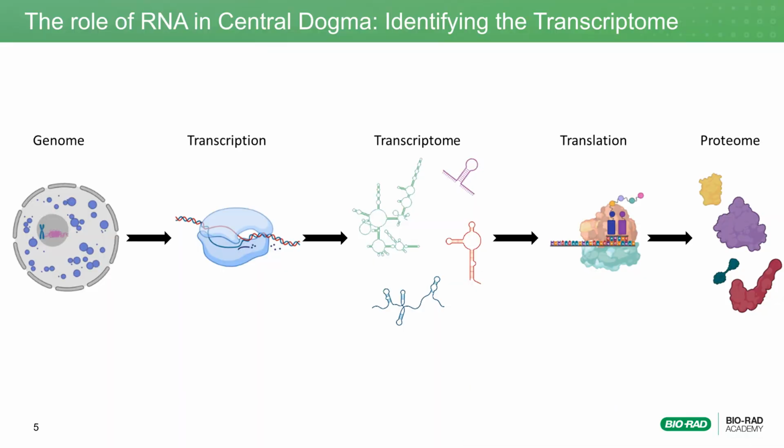From Module 1, you learn that scientists are interested in studying gene products for added insight into cellular function. RT-qPCR is a highly effective and popular method that is currently used in many fields of scientific research. This method allows scientists to get a closer look at how certain variables affect the synthesis of gene products. Gene products, such as proteins, determine the function and therefore the purpose that a cell carries out. These gene products are not static but fluid in their makeup depending on environmental cues.